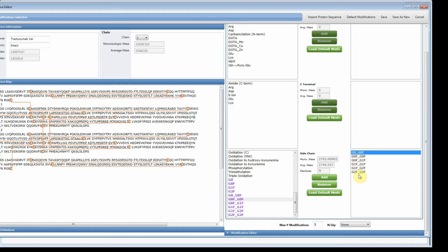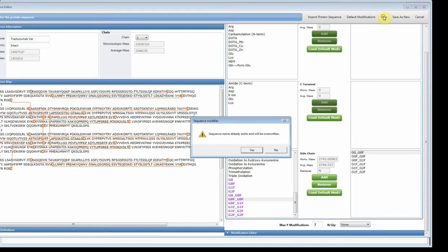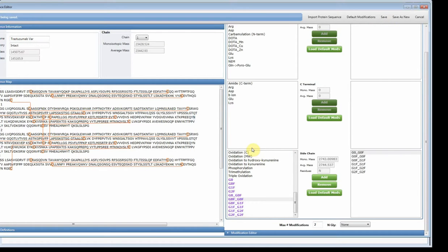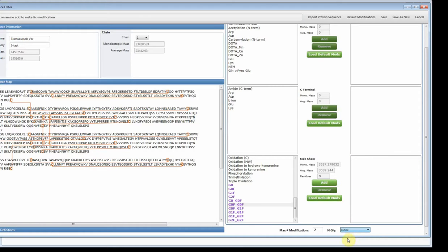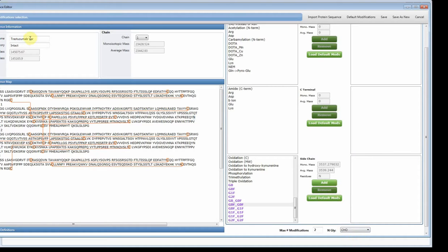I can add each one of these as a variable modification for a targeted search. So if you know that these six glycans should be in your molecule, you can add them as variable mods and save this. I often name it with the protein name, then 'variable,' and save. Your other option is to expand the glycans and see what other combinations are there. I'll remove all of these and turn on CHO. I'll label it CHO and also add 'intact' as my category, then hit save.